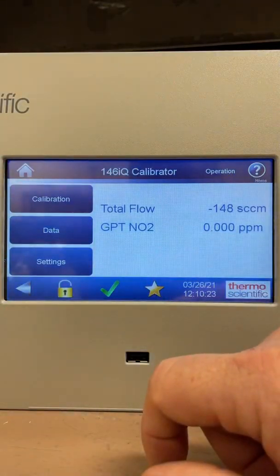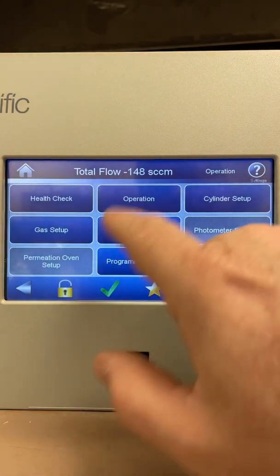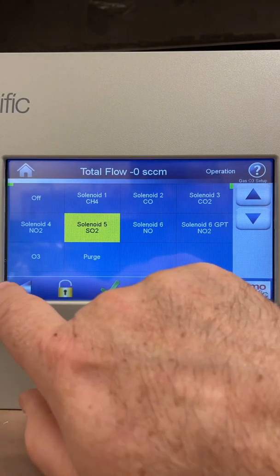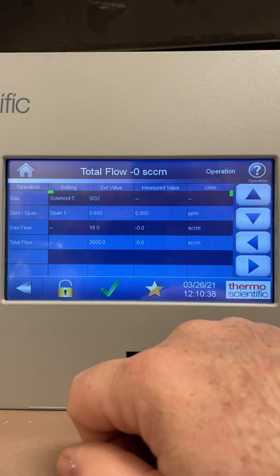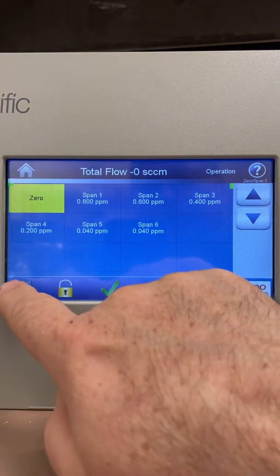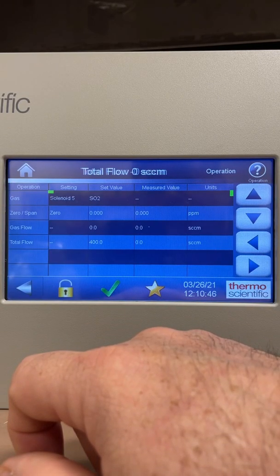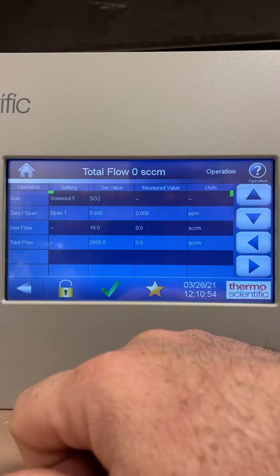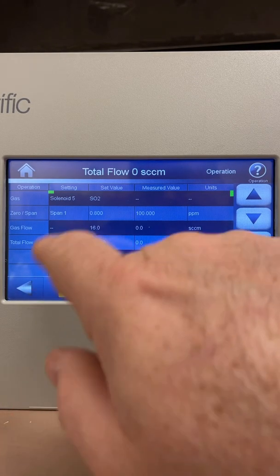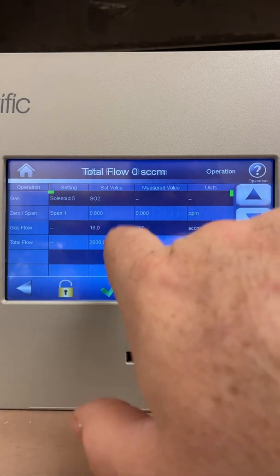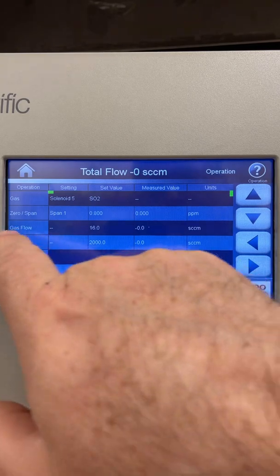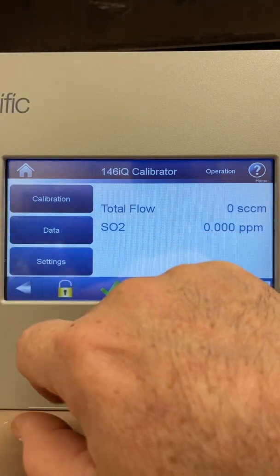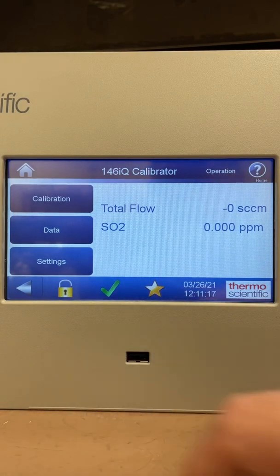That's a brief overview of how to operate the instrument — Settings, then Operation. For a basic SO2 calibration, mine is set on solenoid 5. Go back, pick zero, run your zero air for a baseline — 15 minutes. Then check span 1 for the high point at 0.8 ppm; the valve opens, lets the gas into the calibrator, run for 15 minutes. Those flow numbers would all populate if I had air running through it. That's the multi-gas calibrator — if you have any questions feel free to comment, thank you.